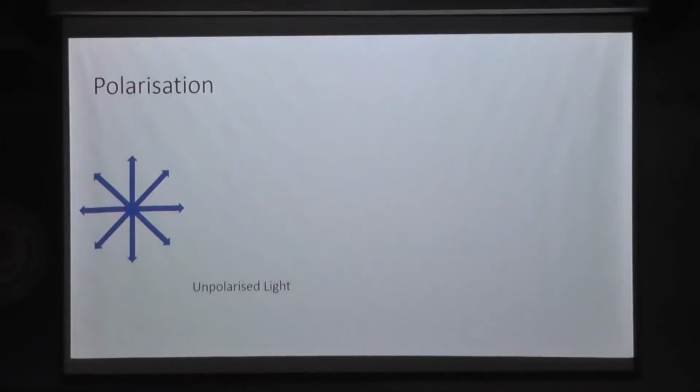If we have multiple such sources, like multiple such planes while the light is propagating, multiple such planes will look like this. And if we resolve them in two directions, then the same light will be seen again as a plus. So what happens? Every single light, sunlight, every single light is unpolarized because the planes of propagation are multiple, and they are always perpendicular to the direction of the ray of light. So we have this unpolarized light in multiple planes.